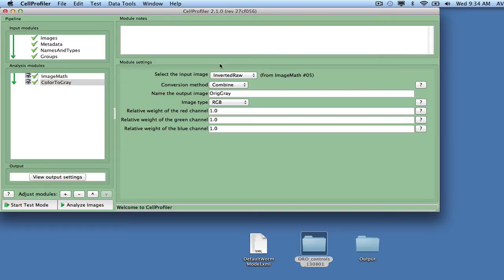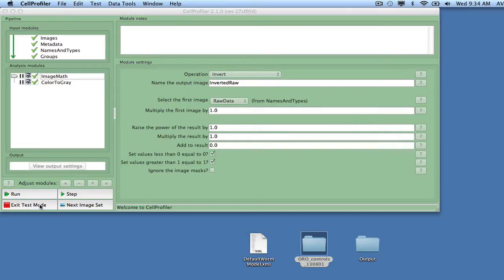To see the effect of a module, click on Start Test Mode. It is now possible to step through the analysis pipeline and monitor the output at each step.